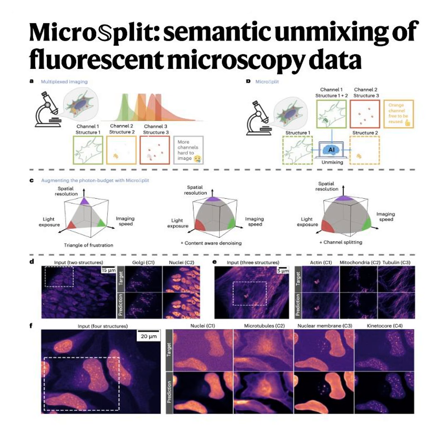Exactly. But because of the heavy denoising and the variational sampling, the exact absolute brightness of a specific pixel might be slightly shifted by the algorithm. So if your experiment relies on knowing exactly how many photons hit a specific receptor, this is not the tool for you. Definitely not. To put all of this into context, though, we have to look at the competitive landscape.